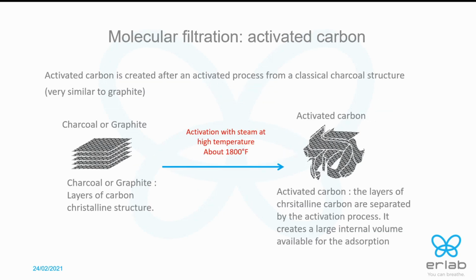So we understand that carbon, the activated carbon, is really the key of this technology, is really the bedrock of this technology, and it's important to understand how it is made. So the activated carbon is the transformation of charcoal or graphite, which we can find in different sources.